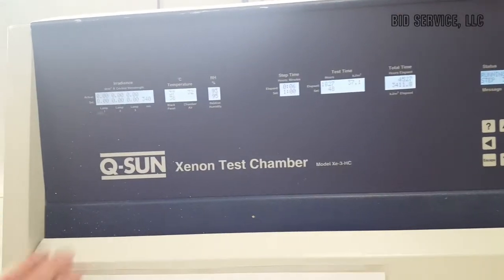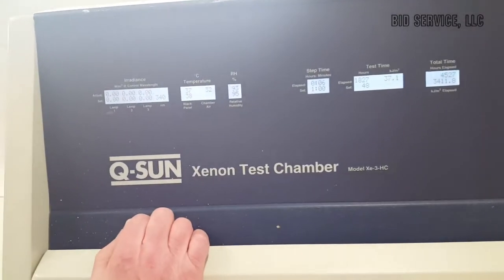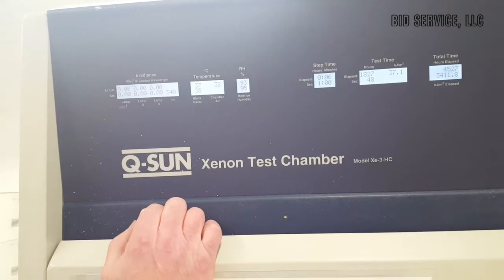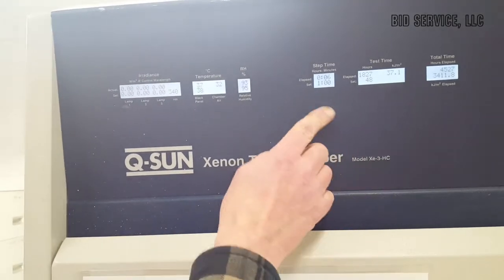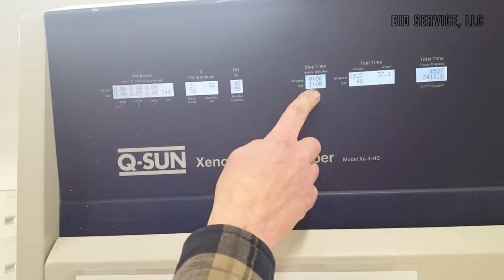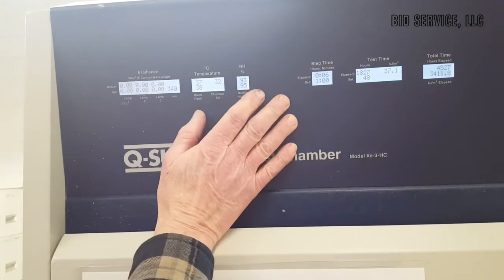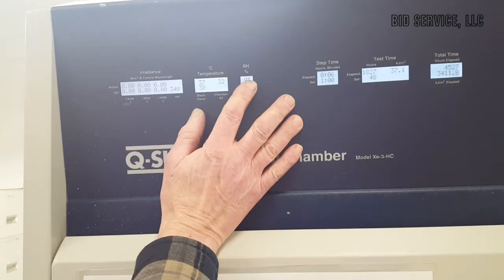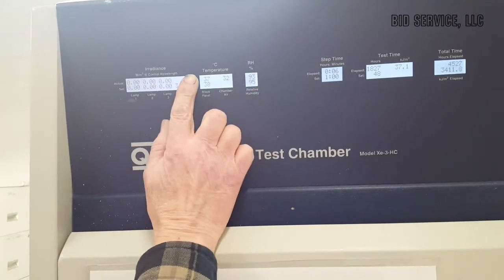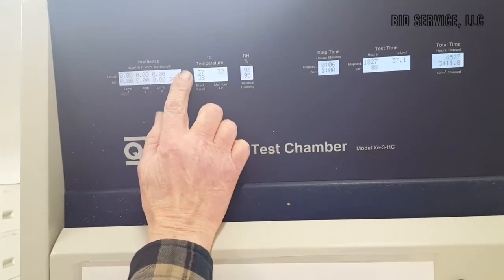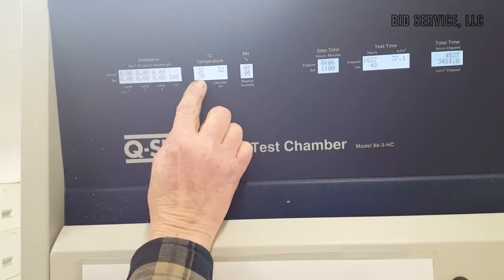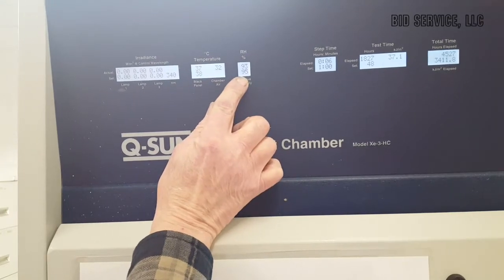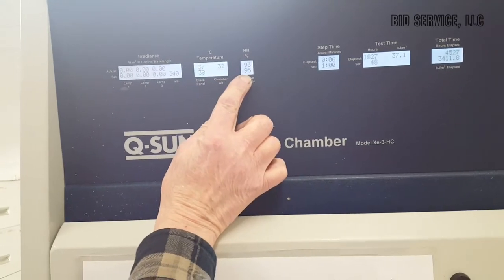Back now. And as you can see with the light off, it comes up very, very quickly. We have humidity of 93. We have a temperature of 37. Our set point was 38. Our set point was 95.